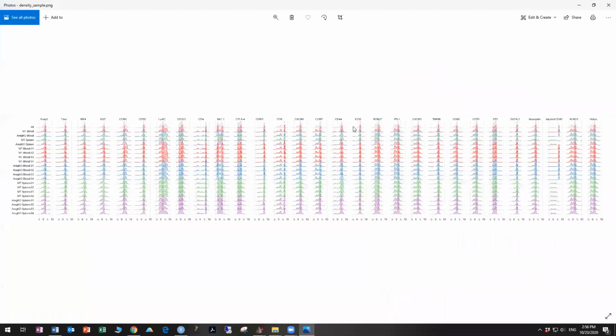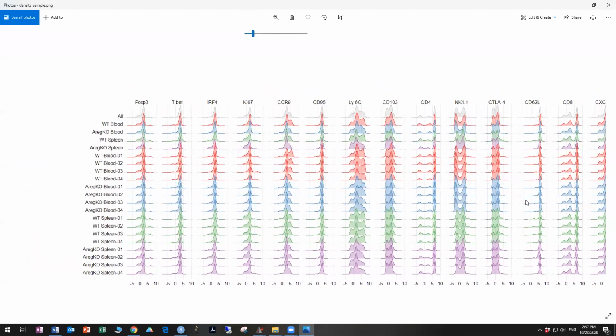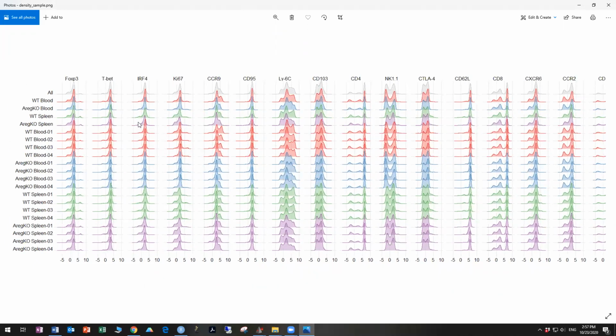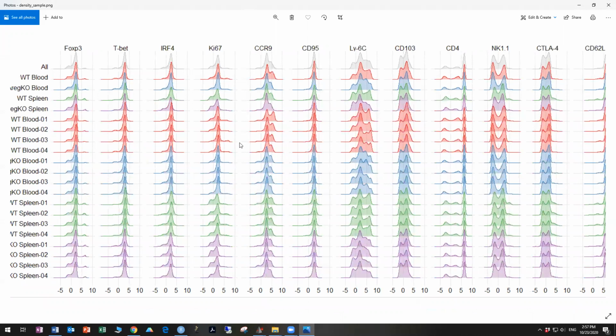We open this up. And what we have here is histograms of each marker in our flow panel for each of the samples. And also at the top, we have the conditions, which are concatenated from the individual samples. And so that you can see it down below, each of these groups is color-coded, and that matches the color coding at the top. And so now we want to look at these markers and adjust the bi-exponential display such that we have bimodal peaks.